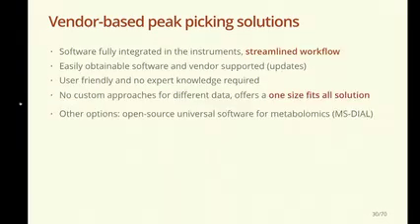But of course, there are advantages to it. The software is fully integrated, so it renders a streamlined workflow. It's easily obtainable as well, and the vendors will support their software. And same with the binning, you can have valid chemometric models with the software solutions. It will not make or break a model. If it would, I would rather say that the data is quite bad. But there are small intricacies which might have bad reproducibility if you use one or the other data analysis pipeline. But from a global perspective, it's not all too bad.